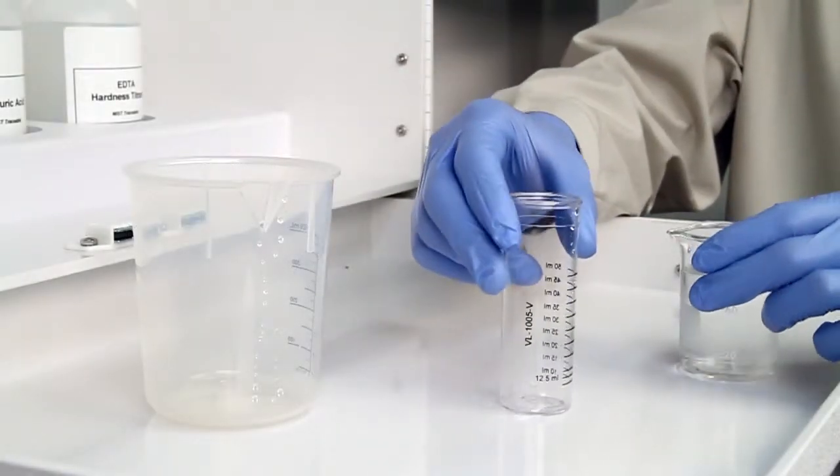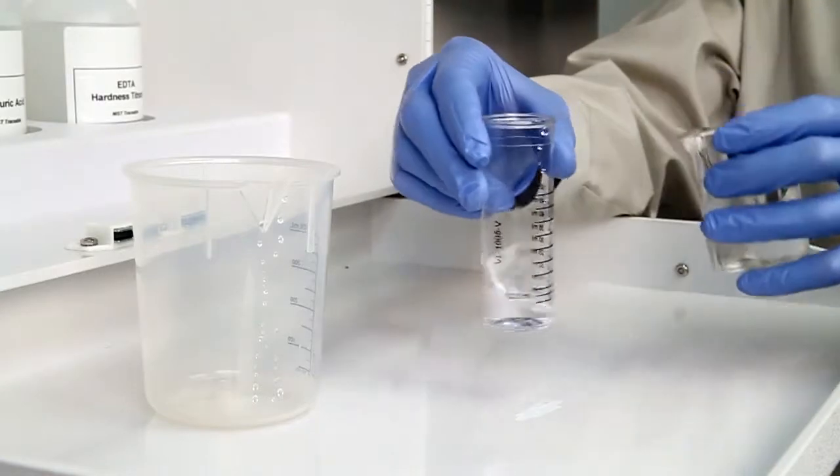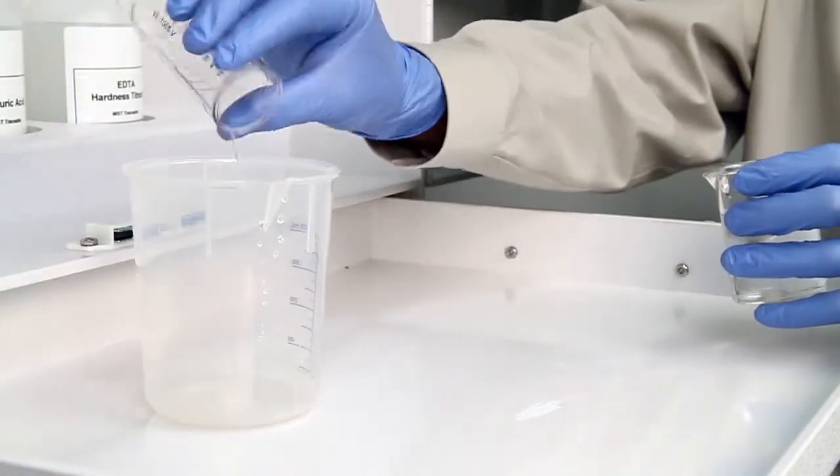The first step according to the EndpointID procedure is to collect an accurate sample. The smallest change in sample size will lead to inaccurate results.